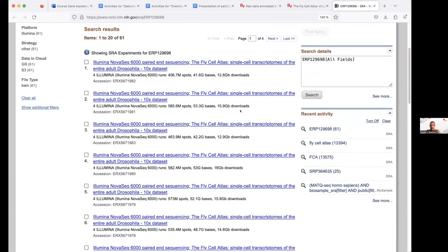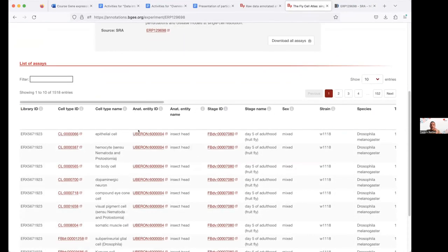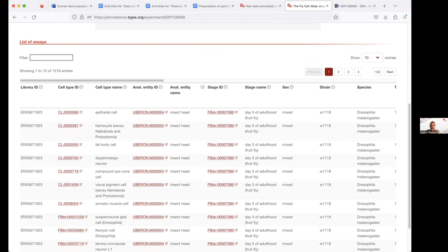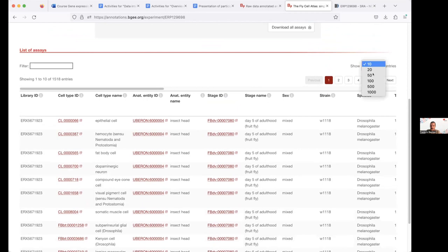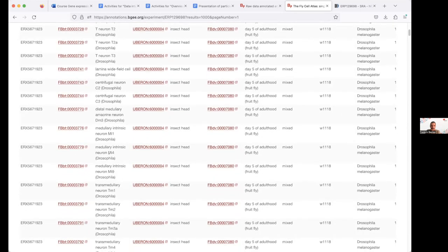Here you can see the annotation of each cluster in the FlyCellAtlas. For single-cell droplet-based data, we do pseudo-bulk — we annotate at the cluster level and pool all cells in the same cluster to perform present/absent calls. This means we have 1,518 conditions representing the FlyCellAtlas, covering different cell types in different developmental stages and sexes. You can see many cell types already obtained from this one single experiment, most coming from insect head in adult Drosophila.